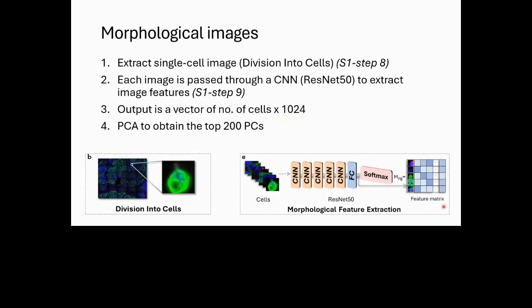What it's doing is obtaining the features for each cell. In this case, we have the image for each cell, one image, and it will extract the features. The big assumption is that some of these cell images will be similar, in that they have the same features in terms of an image, the same spatial distribution of the pixels. And the output will be a vector of 1024 features for each cell. Okay.